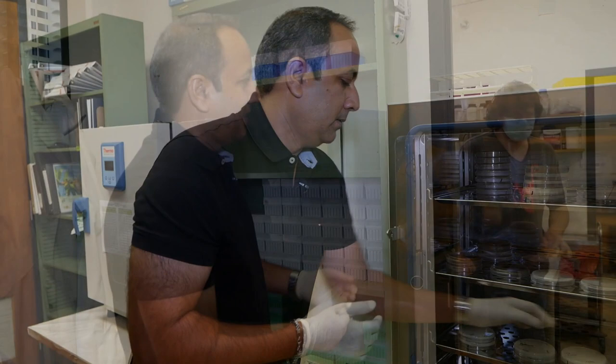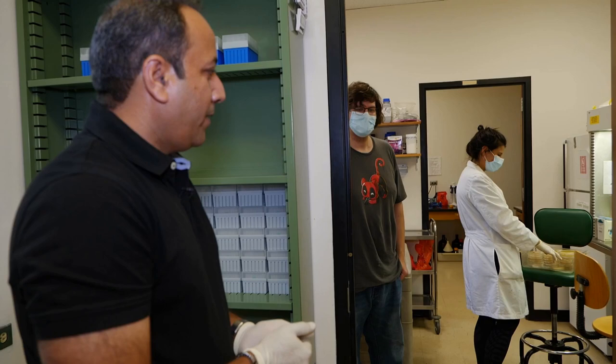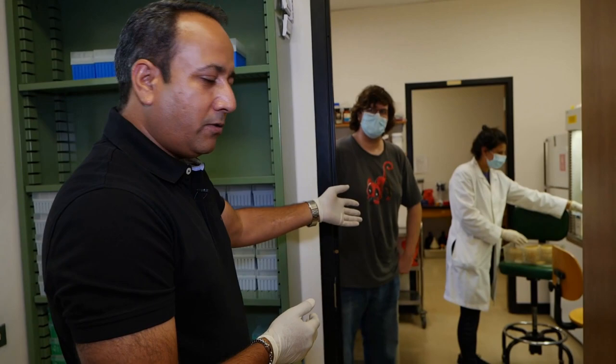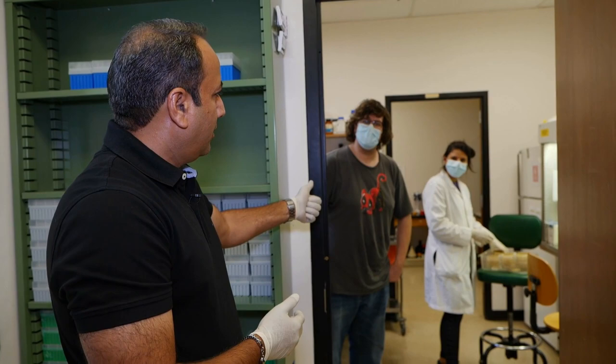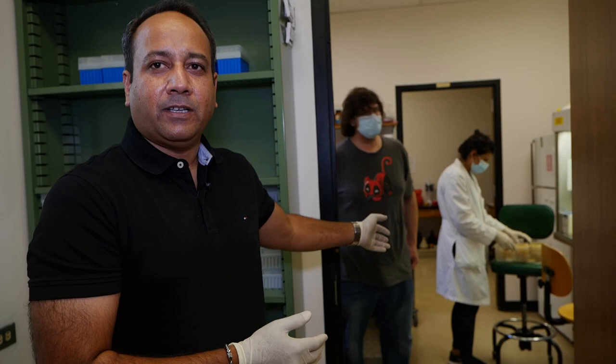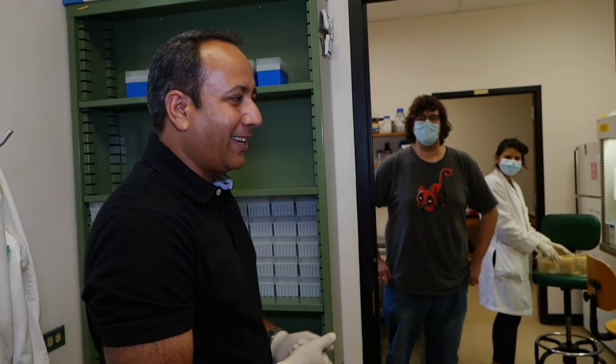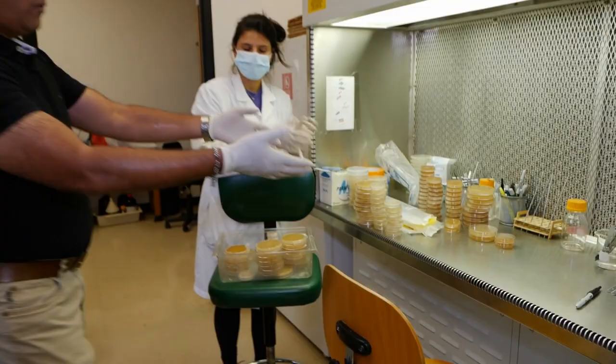This is my staff here - Mr. Tim Burks and Dr. Monique D'Souza. Dr. D'Souza started working with me last year and I'm very fortunate to have her. And Mr. Tim Burks over here, he has been working with me for how long now, and he is our lab manager. He takes care of most of your samples here. I might just send you the report, so he's the main man behind all these scenes.